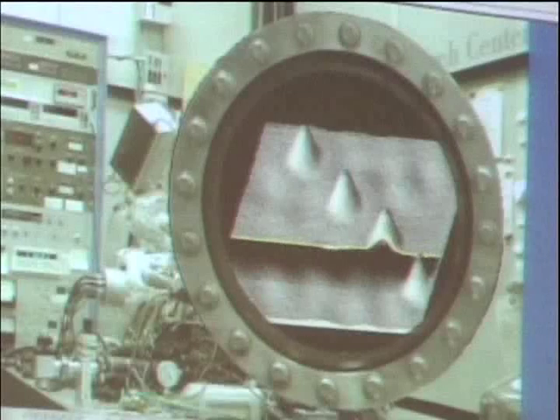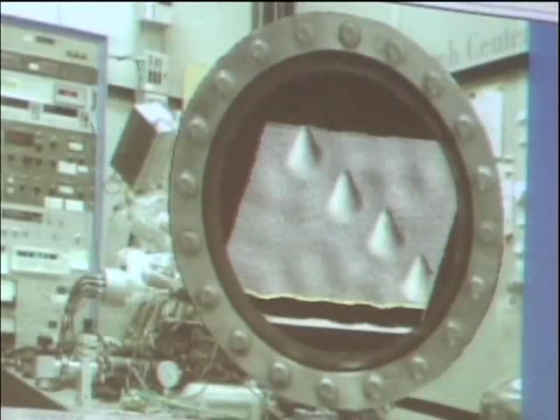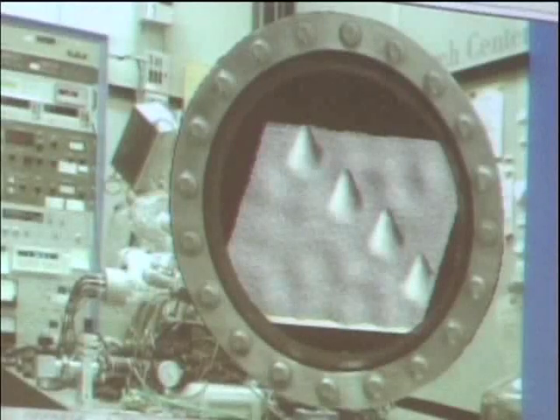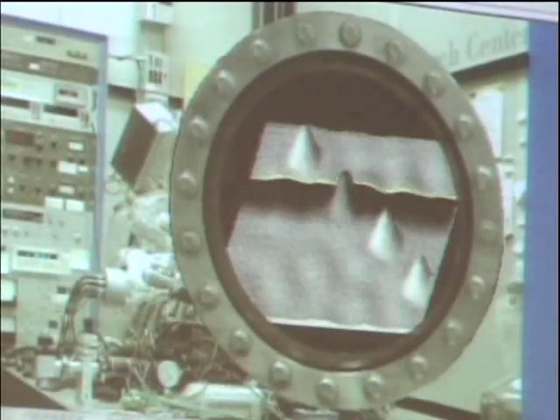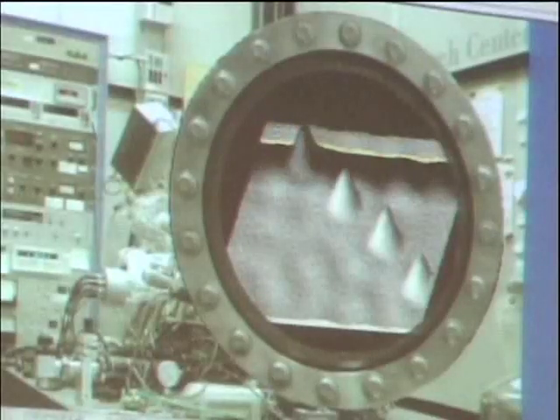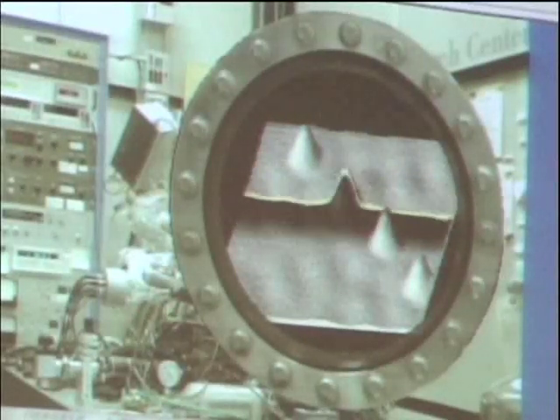I'm not sure which atoms we have that we're looking at right here. These might be copper, they might be cobalt. Well, that's Chris. Maybe he knows. Hey, Chris. Are those copper atoms or cobalt atoms? Copper atoms. Thank you. Copper atoms. Sebastian picked out 4 atoms for you. Is that what you see? Yes, that's what we see. It looks very good. And they're looking really quite nice, I must say. Well, they're individually selected. Thank you.